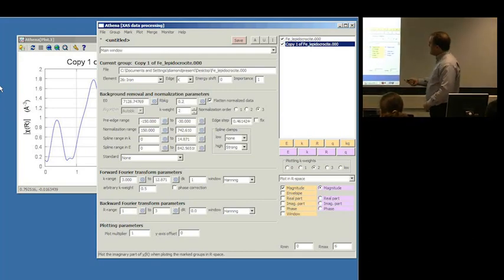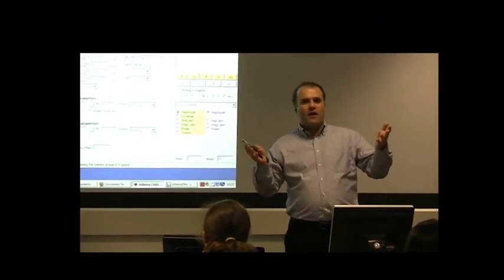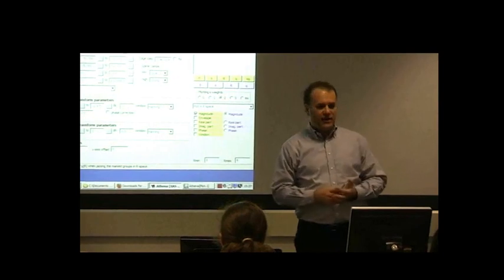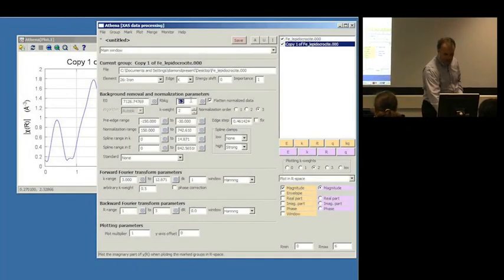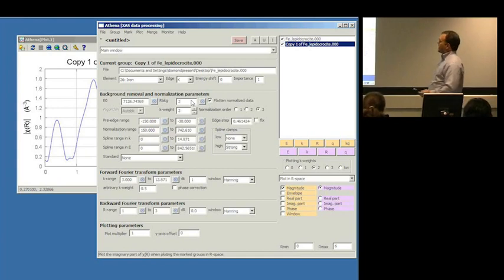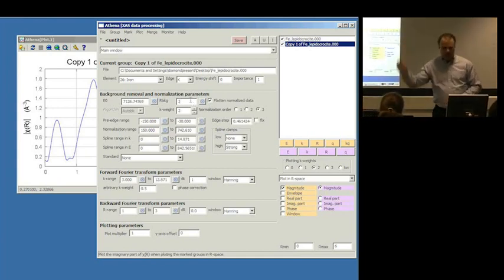So it would seem that the naive answer at this point would be to make RBKG as big as possible. Well, that's probably not the right answer either, but let's give it a shot. Let's choose what I know to be an absurdly large value for RBKG of 2. And I'm going to plot the two things together just like I did before.